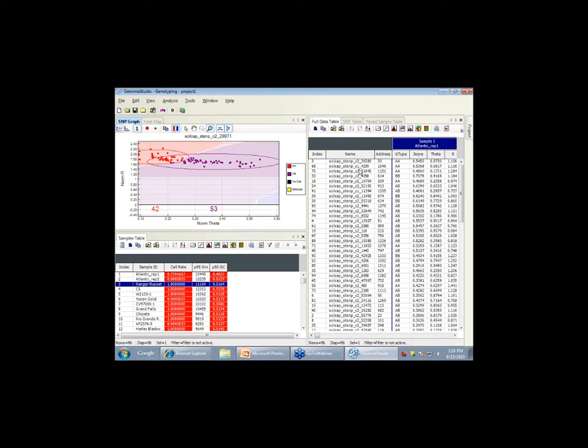So we haven't mapped these. We don't know where they map exactly, but we know what sequences they are and where they are, so which scaffolds they are associated with on the genome, essentially. So that's what we know for now for this.